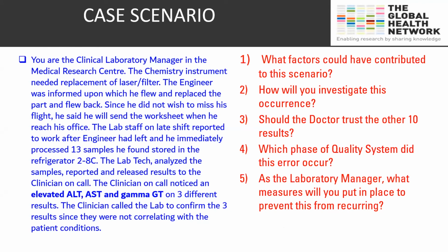There's the instrument lab validation. Yes. So the instrument was not validated. Yes, correct. I agree. And Said says the engineer at least should have communicated on the performance of the instrument. Yes, that must happen. Whenever the engineer comes to your site, they must complete the worksheet and leave, not just walk in and walk out. They must communicate with somebody who's in the laboratory. Any other answer? Good answers coming in.